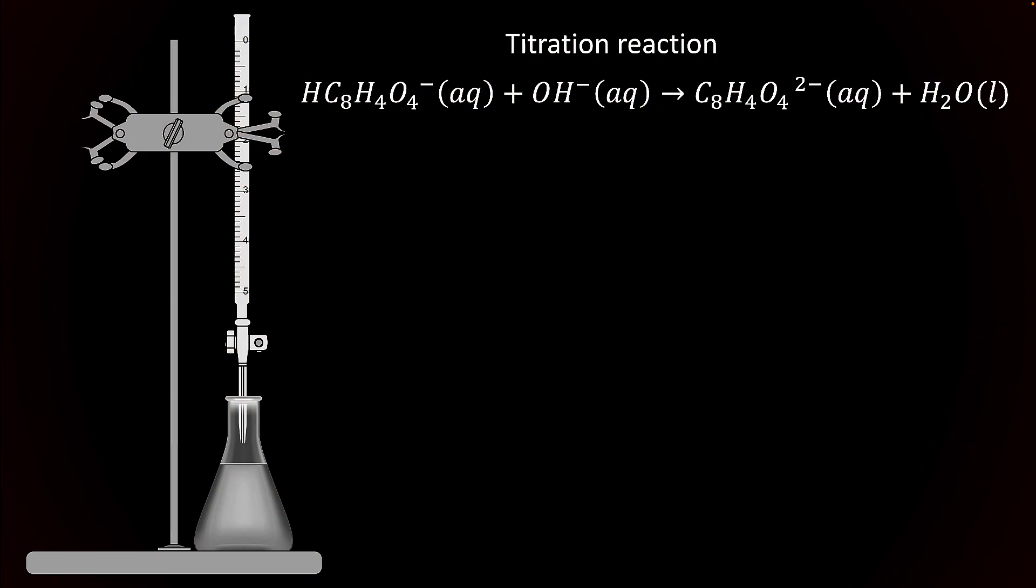To start, we fill a burette with our 0.1 molar solution of sodium hydroxide. Remember, this concentration value may be inaccurate, which is what the standardization process will ultimately determine.